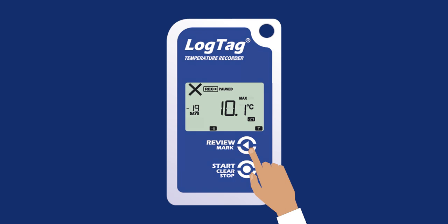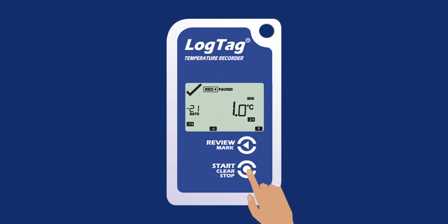Continue to press the Review Mark button to work through the days where an alarm excursion occurred. Press the Start Clear Stop button to exit the statistical review.